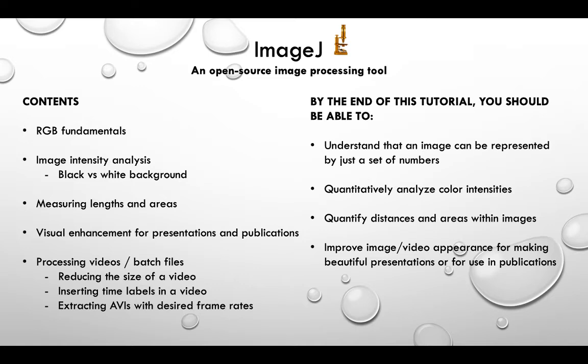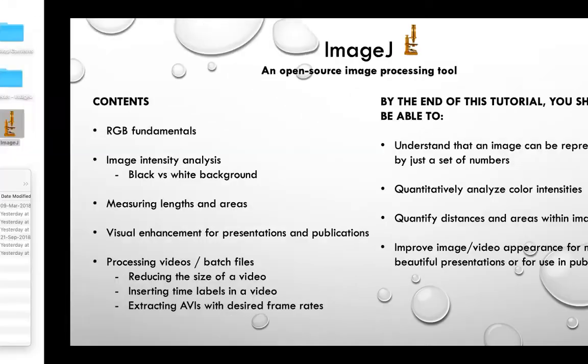What happens though is that if you capture images at the highest quality, and often our videos in paper fluidics are 15 minutes, 10 minutes or so, these videos are huge. They can be 1 GB, 600 MB. And I have seen many times that we try to insert those videos into PowerPoints, the PowerPoint file fails or just refuses to open. And so we'll see how to manage this issue, how to shrink video size, how to make them look better, and so on and so forth.